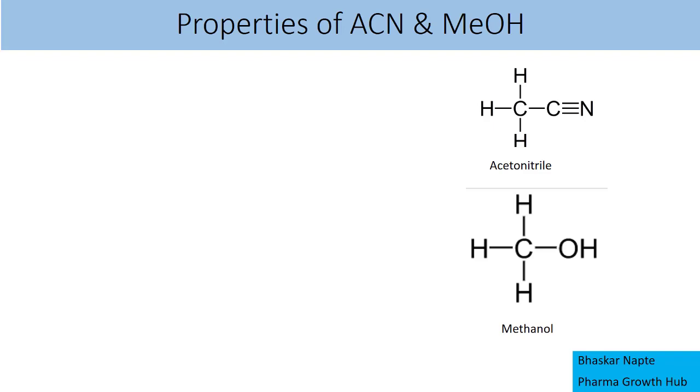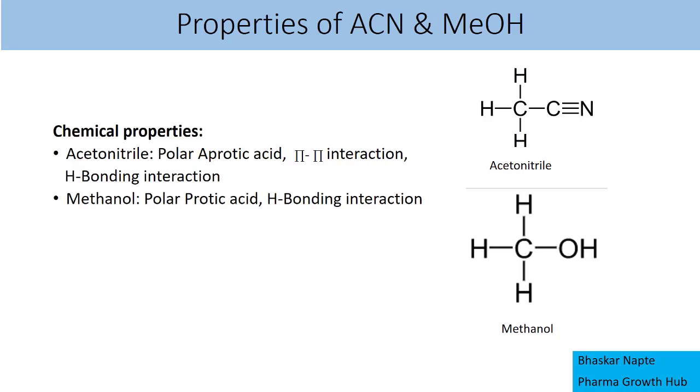So, what are the properties of ACN and methanol? You will see the structure of ACN and methanol on the screen. ACN is a polar aprotic solvent.